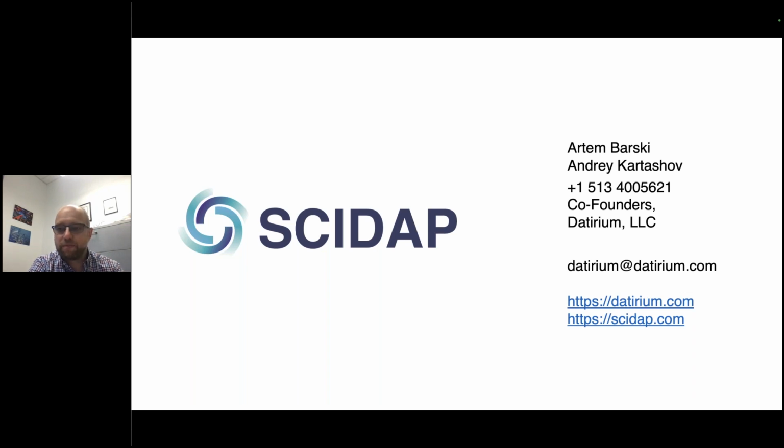Great. Our next question is, Harmony or Seurat, which is the best for sample integration? So this depends on your sample. We have both Harmony and Seurat as possibilities for integrating the data.